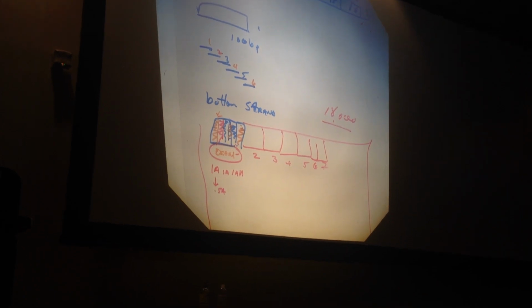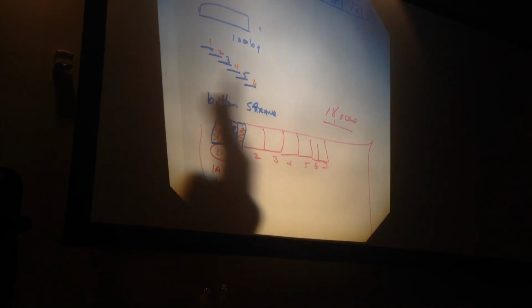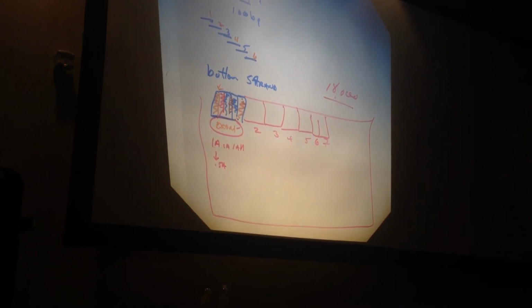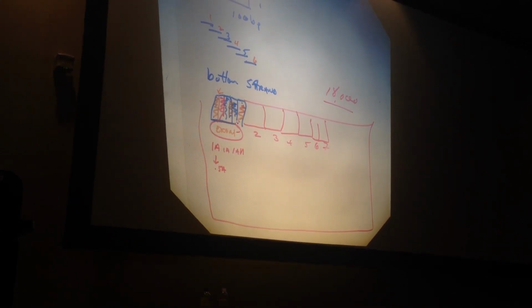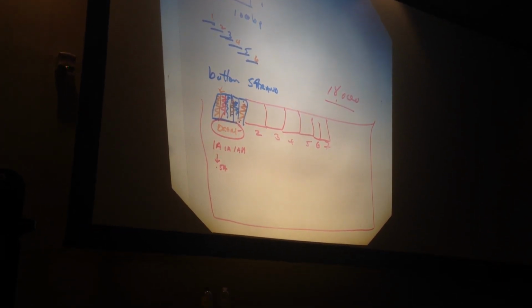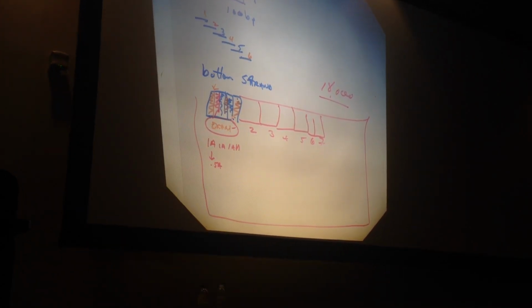So for 2, 3, and 5, what does that mean, the red and the blue? Does it mean that? No, it's just different oligos. I just color-coded them for you. So each chip with each oligo is measured differently? Yes. Each little unit within a unit is measured in different terms. They're very sophisticated chips. Remember, these are like the system software people that make your chips for computers. They're doing the same thing, but with DNA onto little units.